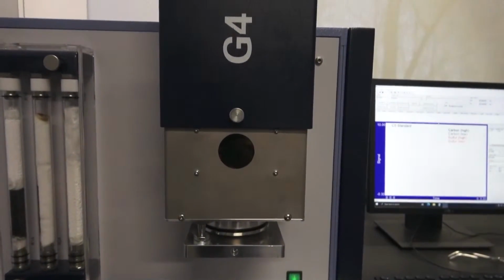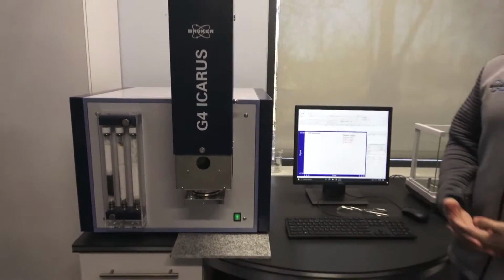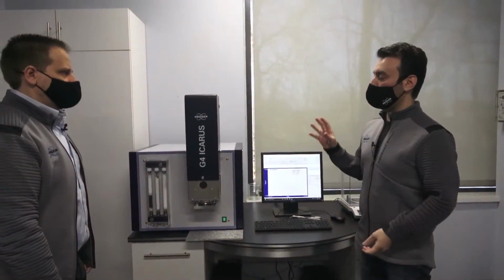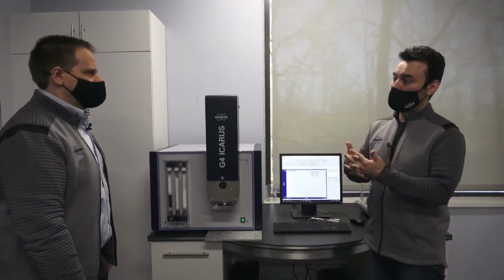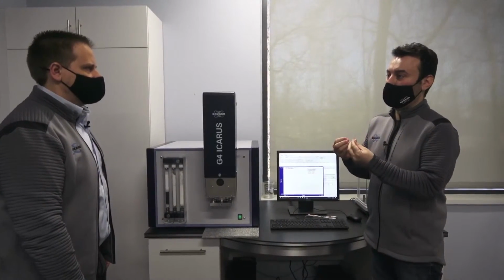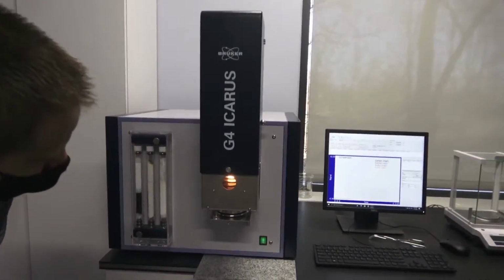Okay. So now you've mentioned an accelerator. So what's the role of this accelerator material? So basically, accelerator is used to create the heat that we need to burn the sample. So once the high frequency induction furnace is turned on, it will create an alternating electromagnetic field, which couples with that accelerator, and that accelerator starts heating instantaneously. That's why we get the heat that we need. And now it's switched on. The combustion has just started.